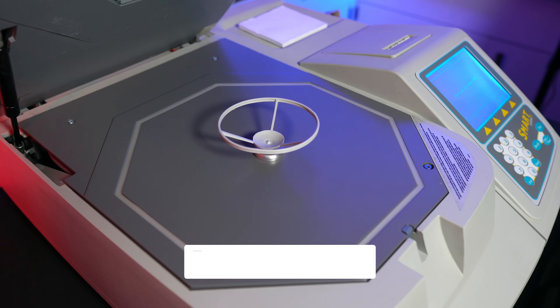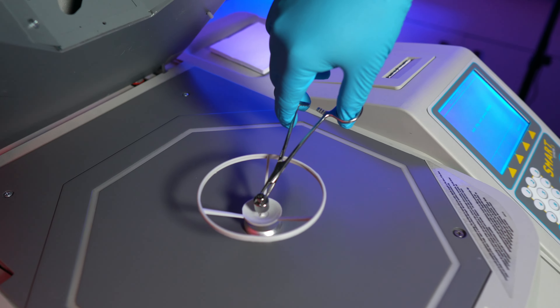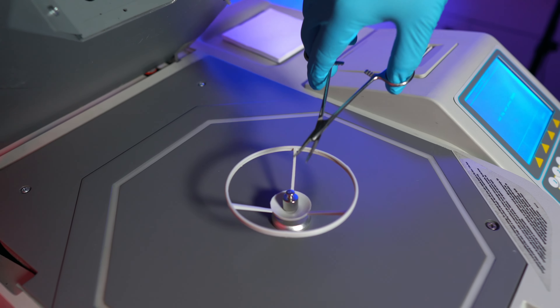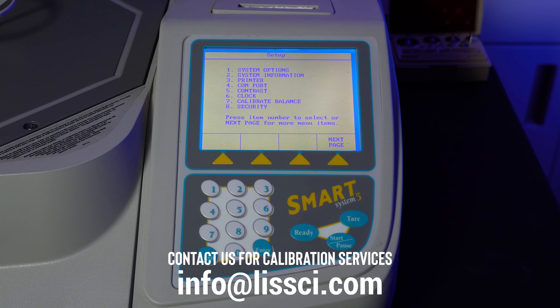Open the cover. Make sure there's nothing on the balance. Press tare to cancel out the weight of the balance. Now you can place the 10 gram weight. Once the calibration is complete, you can remove the weight and press any key or exit to return to the setup menu.